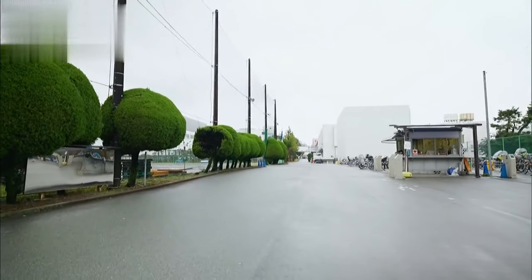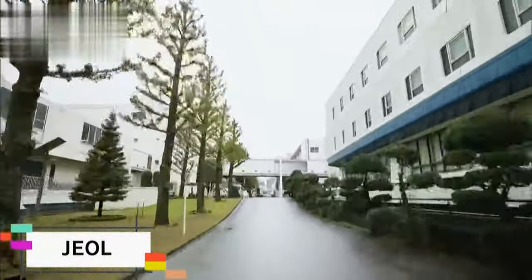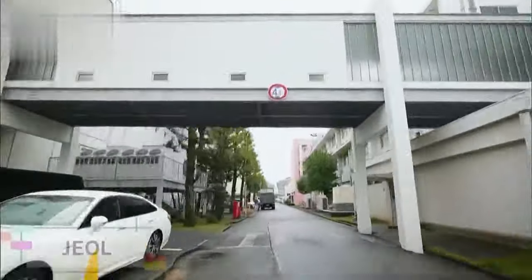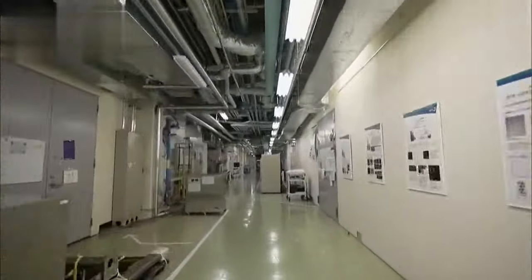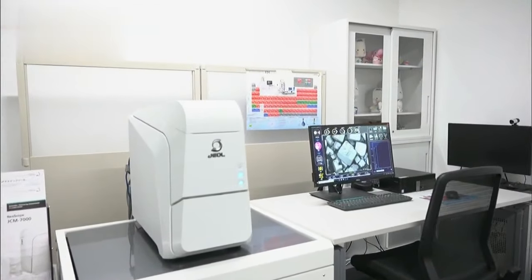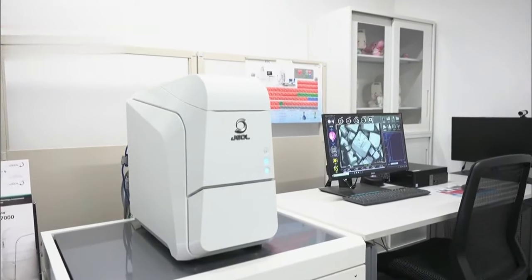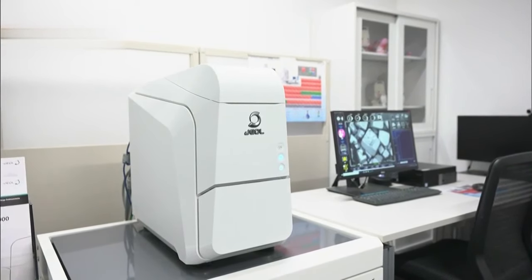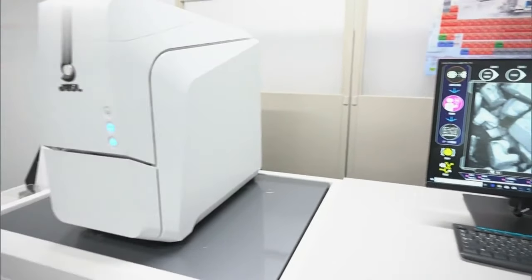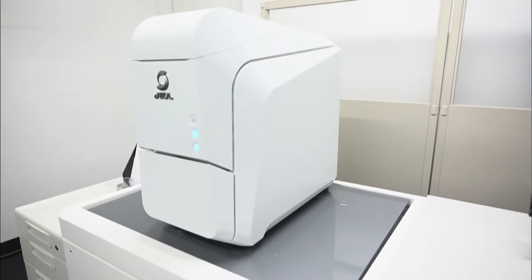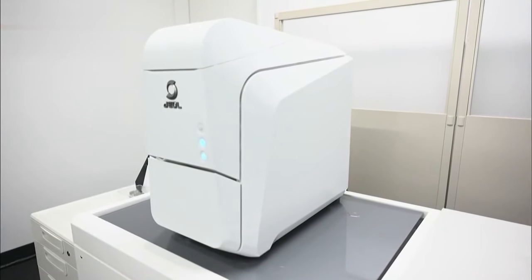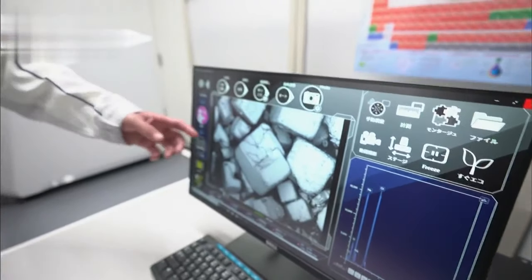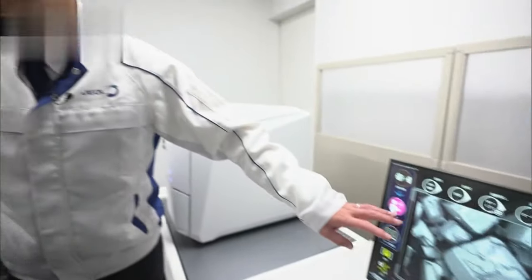At an electrical equipment manufacturer in Tokyo, we discovered a small electron microscope used for demonstrations. We asked engineer Ishikawa Isamu to find out what makes it special and how it differs from an optical microscope.